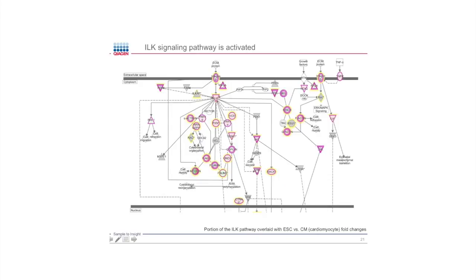You can see lots of different genes in the data set at the final stage. Some were upregulated, some are downregulated. And so one thing you can do is query this pathway as to what functions are relevant. There are some that are already drawn into the pathway, like cell motility and how it affects actin polymerization and things like that.